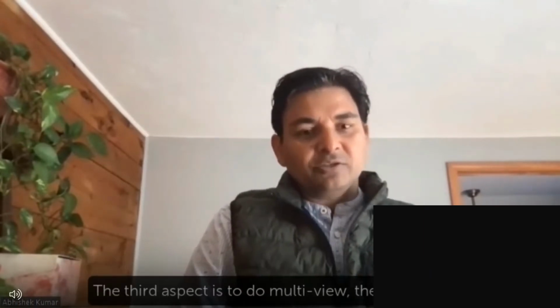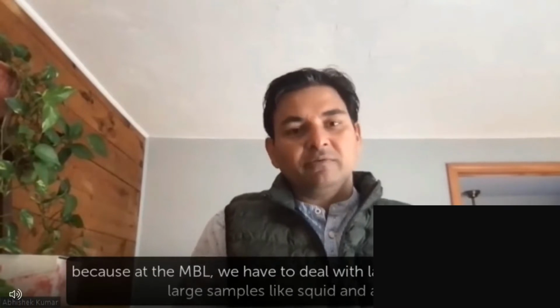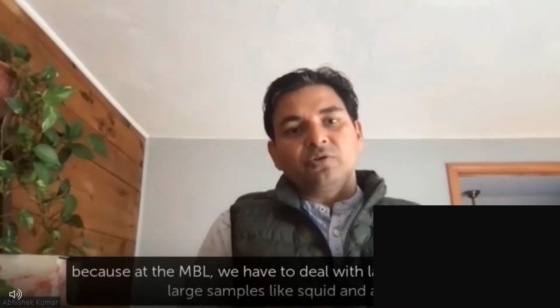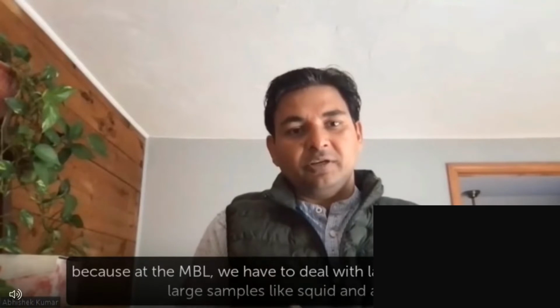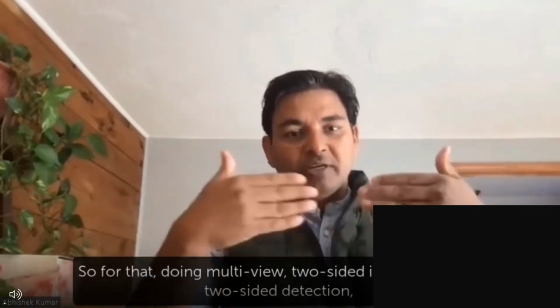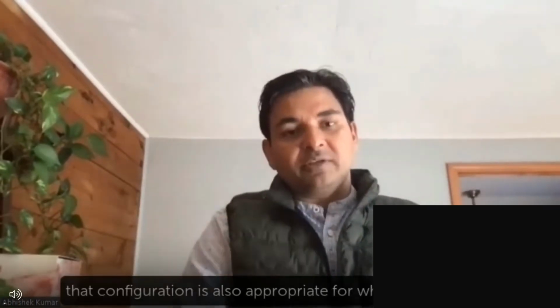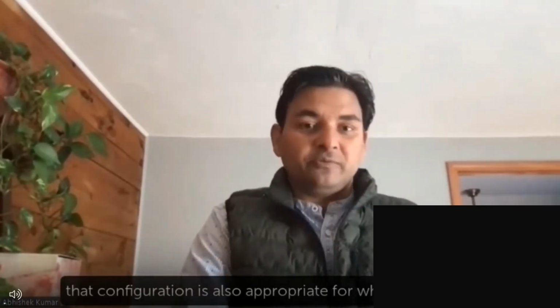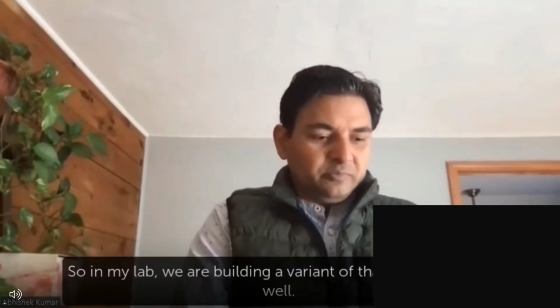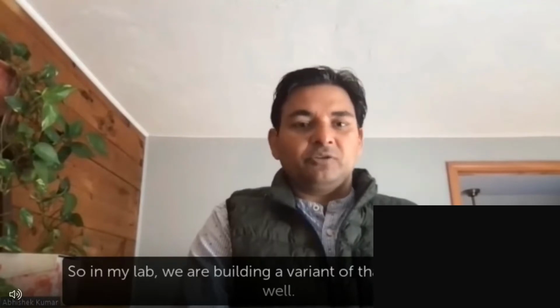And the third aspect is to do multi-view. Because at the MBL we have to deal with large embryos or large samples like squid and all. So for that, doing multi-view, two-sided illumination and two-sided detection, that configuration is also appropriate for what we are doing. So in my lab, we are building a variant of that microscope as well.